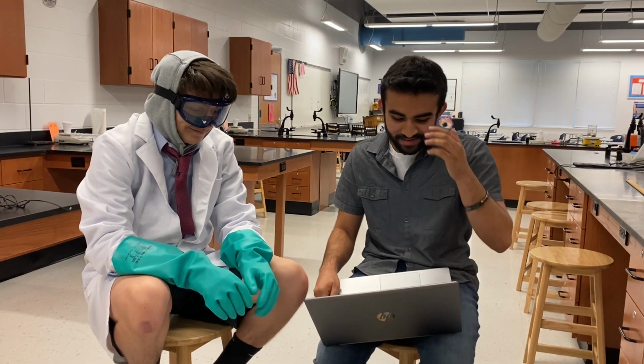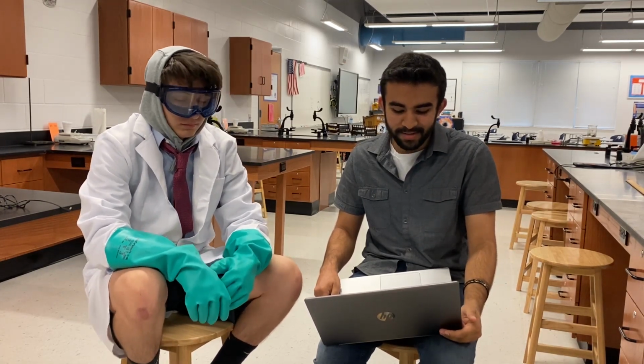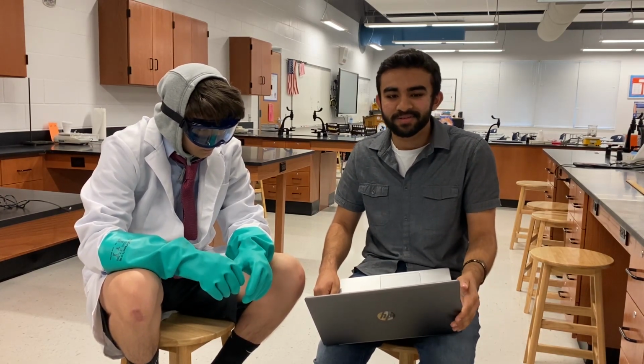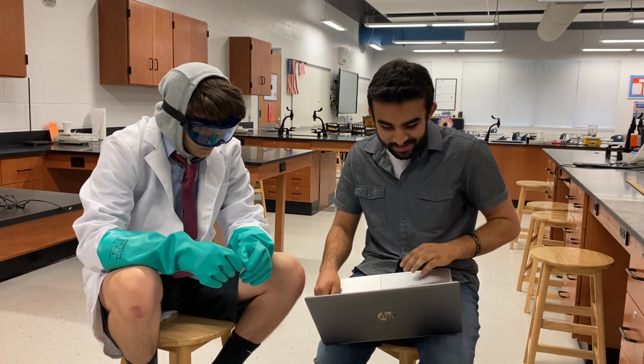Anyway, so never work alone in the laboratory. A certified instructor must be present at all times in the laboratory. So, we're pretty redundant here. So, the main thing is follow your instructor, follow the rules, and you'll be set.